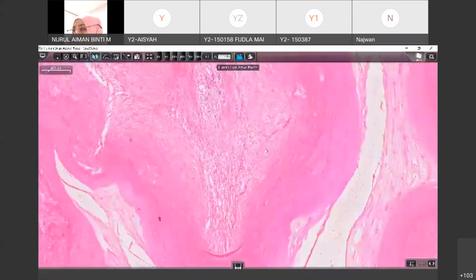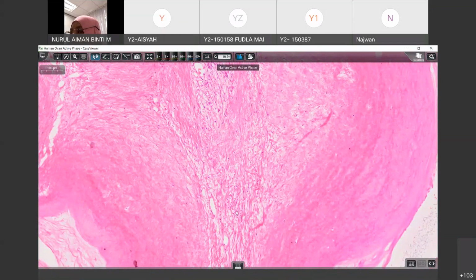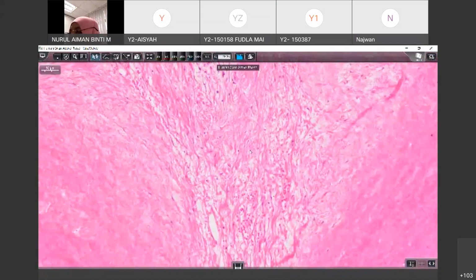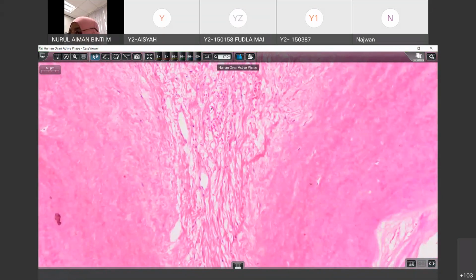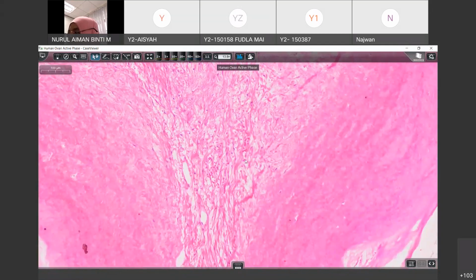Yes, it should be the theca lutein cells, because in the appearance of theca lutein cells, there will be a lot of empty space in between. They are steroid secreting cells. Actually some of the cells in between here are part of the granulosa cells. In between the folds you have the granulosa cells, and the lot of empty space here is the theca lutein cells.